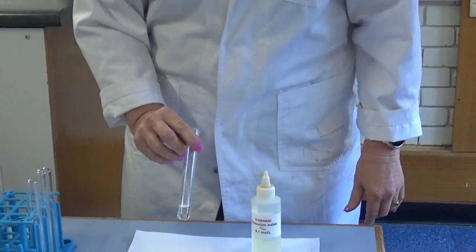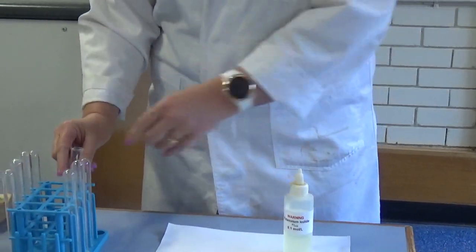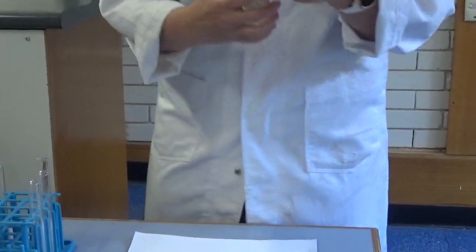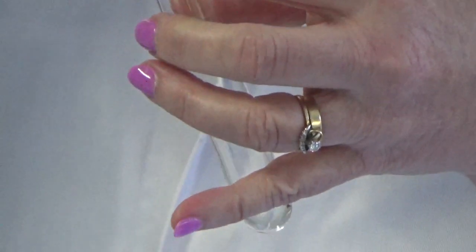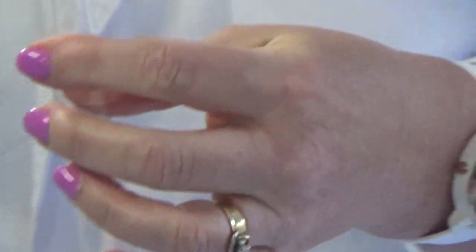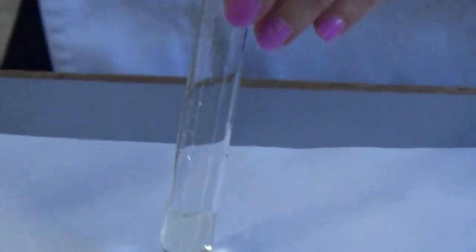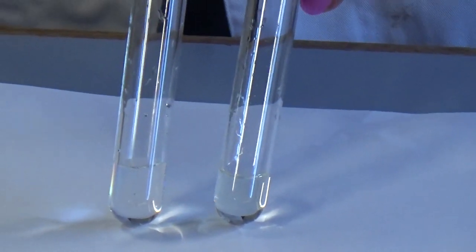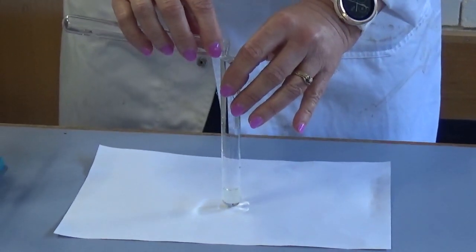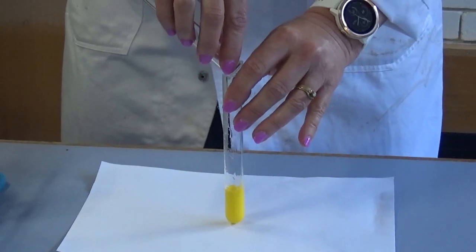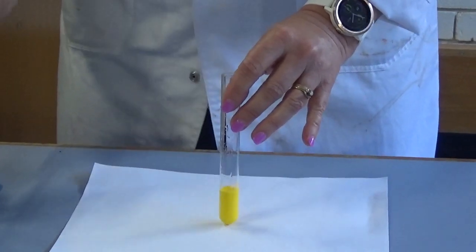So I'm going to put some lead nitrate into a test tube. You can see that the lead nitrate is a colourless solution. Now I'm going to put some potassium iodide into a different test tube and you can see that's colourless, it's kind of a little bit yellow. Now I'm going to pour these two solutions together and watch what happens.